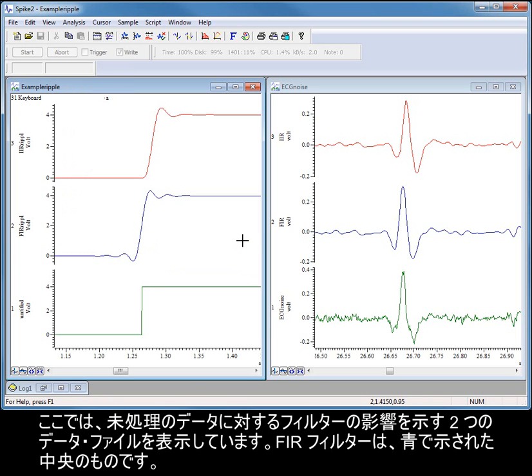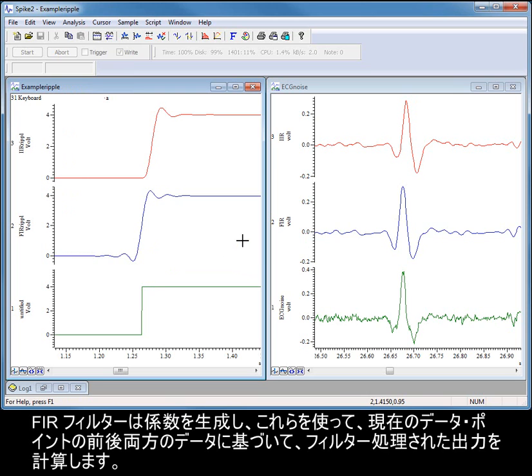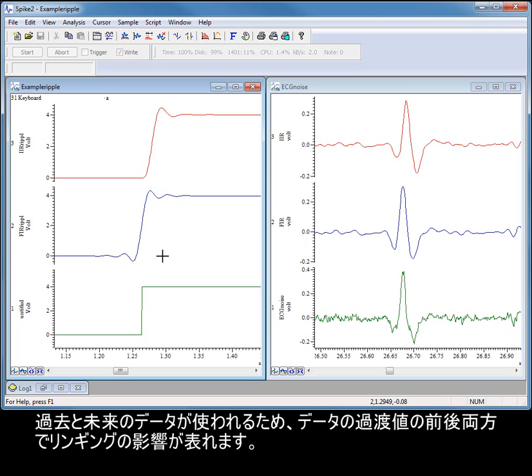Here I am displaying two data files showing the effects of the filters on raw data. FIR filters generate coefficients and use these to calculate the filtered output based on the data both before and after the current data point. Because they use past and future data, they introduce ringing effects both before and after transients in the data.